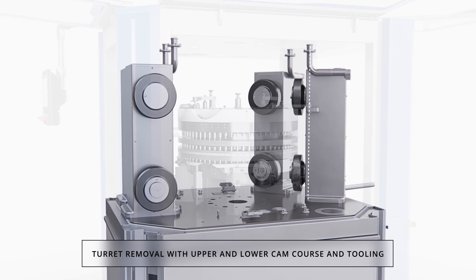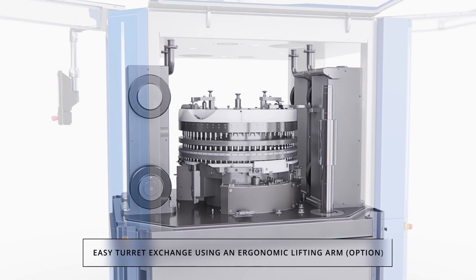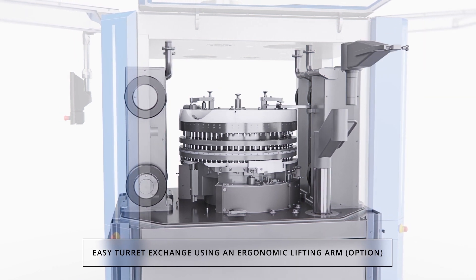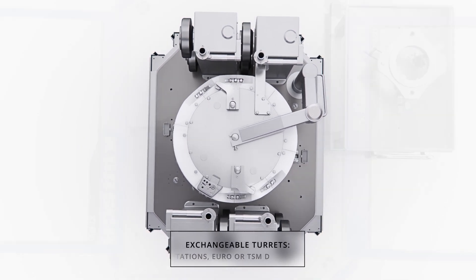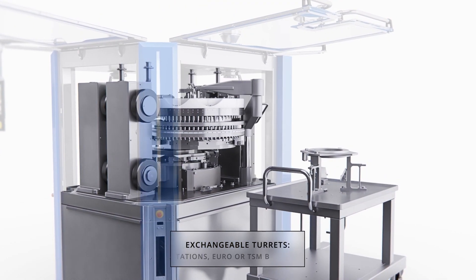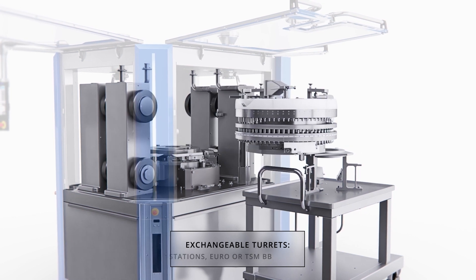The turret design permits the removal of the entire turret including cams and tooling. An internal lift arm is utilized to lift the turret and place it on a transport cart. The turret may then be cleaned and serviced offline while the next turret is installed on the press. This exchangeable turret capability provides the opportunity to run any tablet size on a single press.